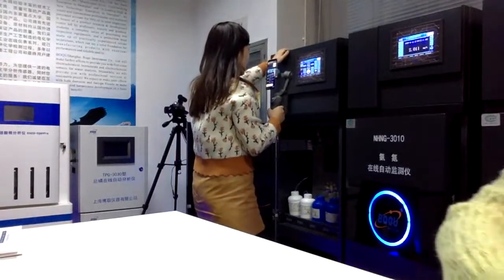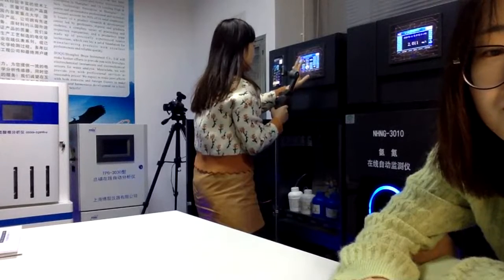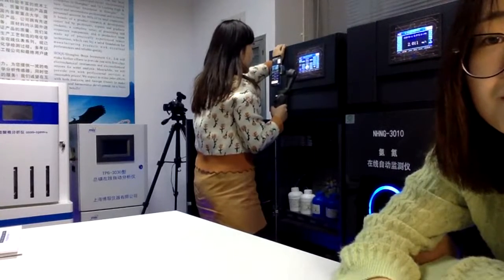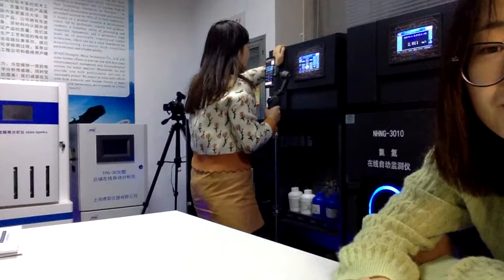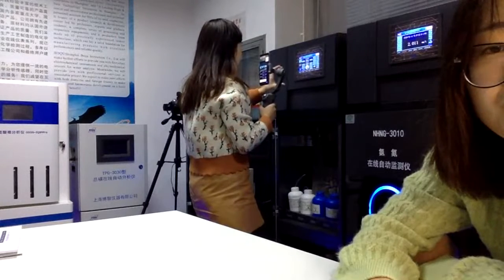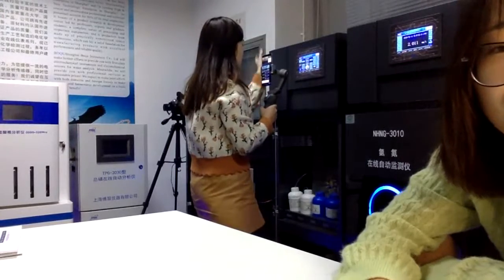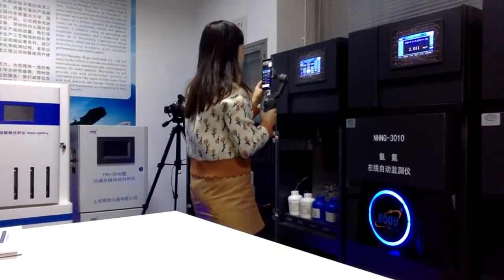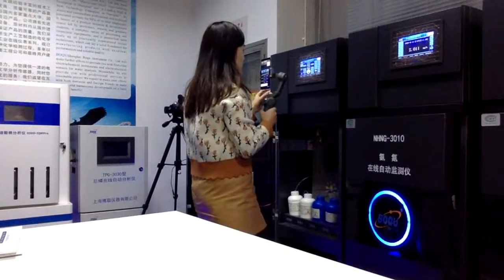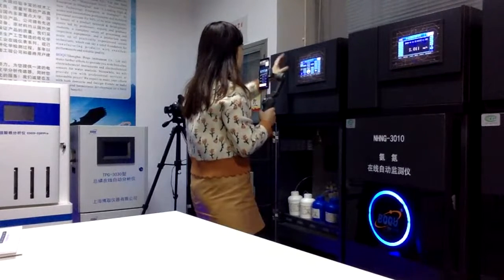And we also have the valve calibration right here, something like the flow button, and the communication testing. So the whole function is put here. You can adjust all the reagents and the water sample and the valves through this page, and check out which reagents or which valves are not working correctly, and also check whether it is correct.